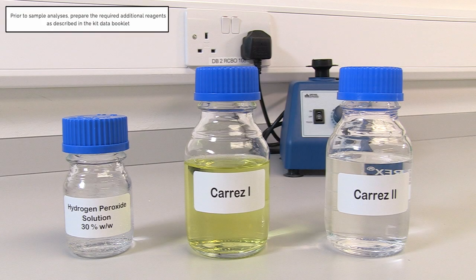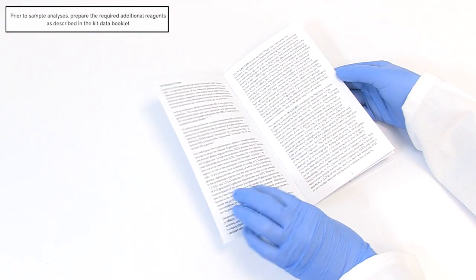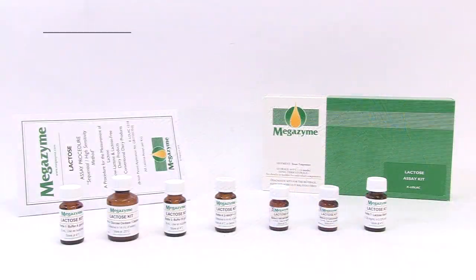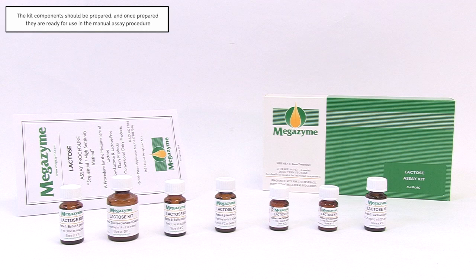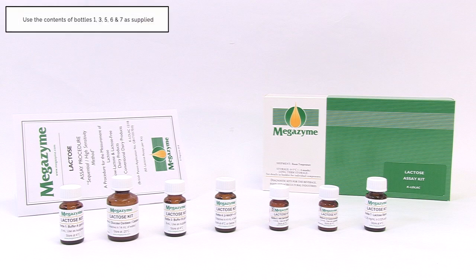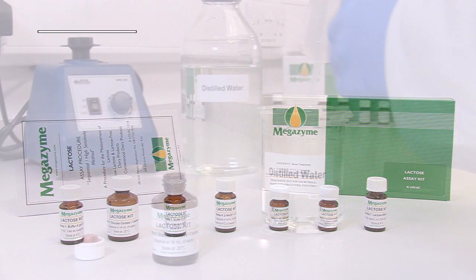Prior to sample analysis, prepare the required additional reagents as described in the kit data booklet. Subsequently, once all of the additional reagents have been made, the kit components should be prepared, and once prepared, they are ready for use in the manual assay procedure. Use the contents of bottles 1, 3, 5, 6, and 7 as supplied.